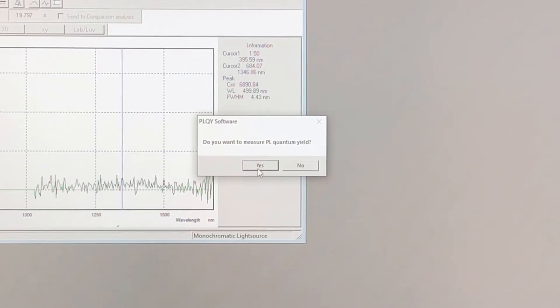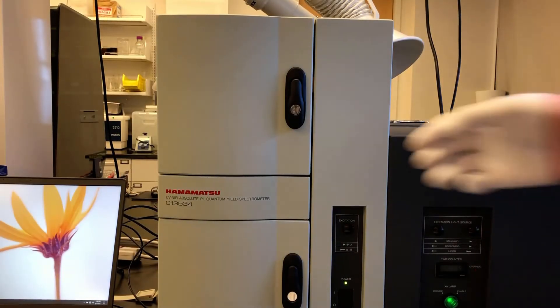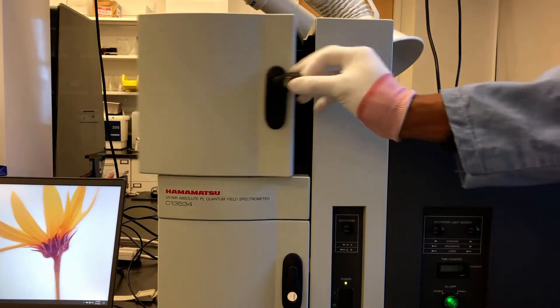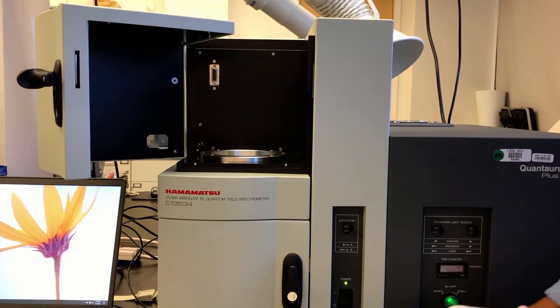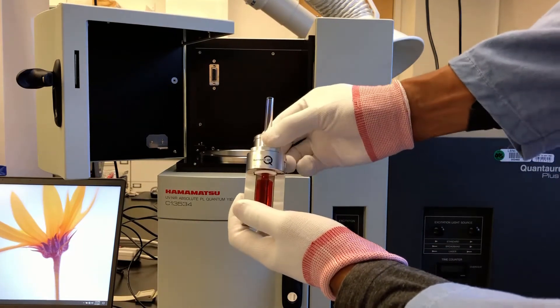Now we're ready for our quantum yield measurement. Let's install the sample before returning to the software. This holder makes it easy to grab the cuvette and load it into the integrating sphere.